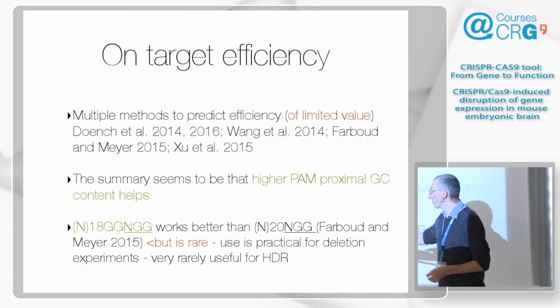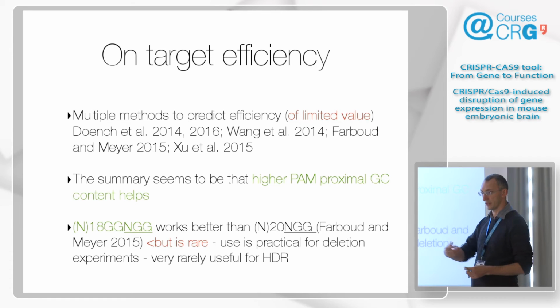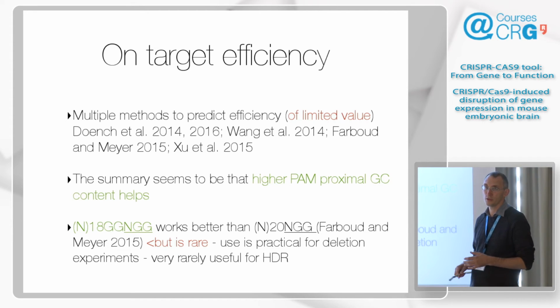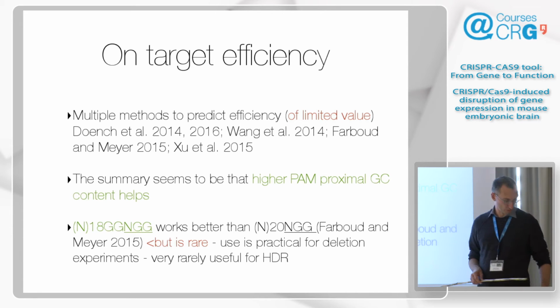Or if they just move the guide one left, right? Almost the same sequence, but without an extra GG. So this is something good to know, but of course this combination is way more rare than the simple PAM. So this has only been useful for us in cases where we have to generate deletions or knockouts, where we have quite a bit of freedom in where to put the guide.